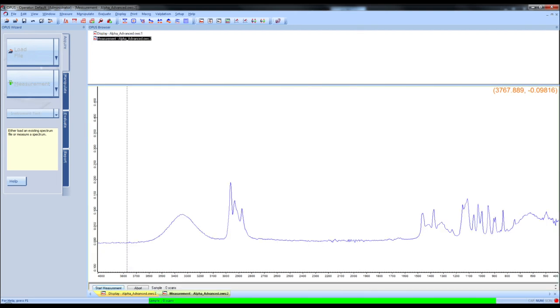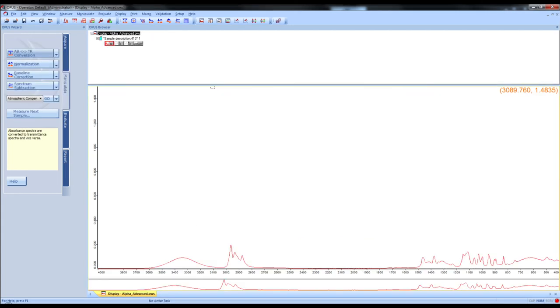If you wanted to continue through all 24 scans, click start measurement on the bottom left corner of the screen. Once all scans have been completed, change the display from absorbance to transmittance using the button on the left.